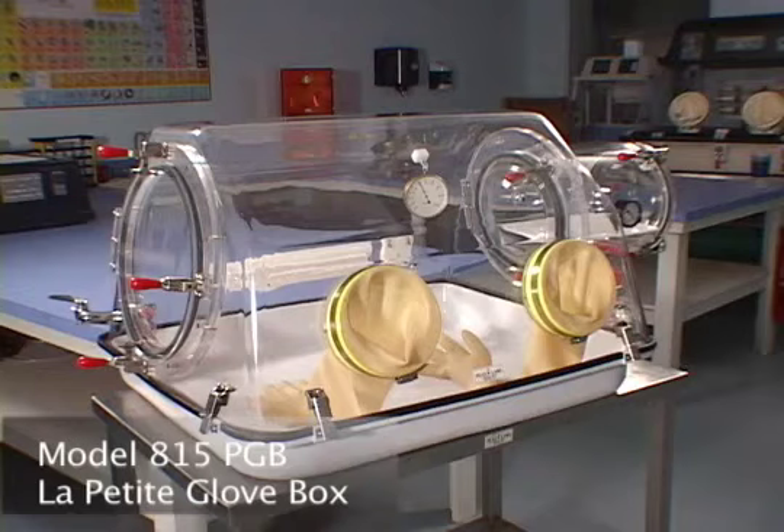The model 815PGB, La Petite Glove Box as we call it, is a mini environment chamber. It is just two-thirds the size of our basic glove box.